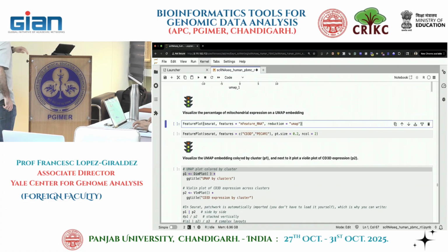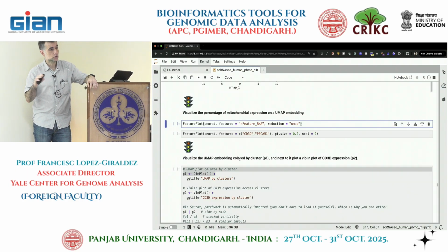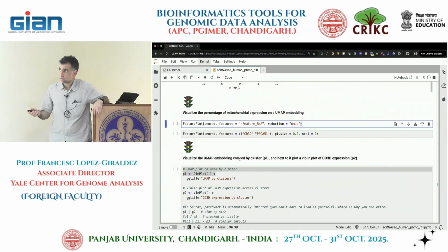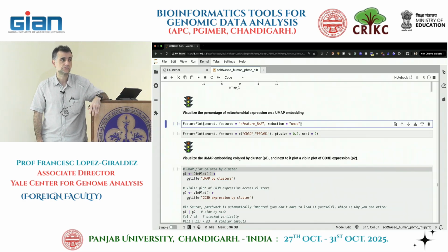All these feature plot, dim plot, all are Seurat functions. So they're created by Seurat, and they use ggplot2 in the background. So I think you can treat these as a ggplot2 and use the functions from ggplot2 to even modify it further.